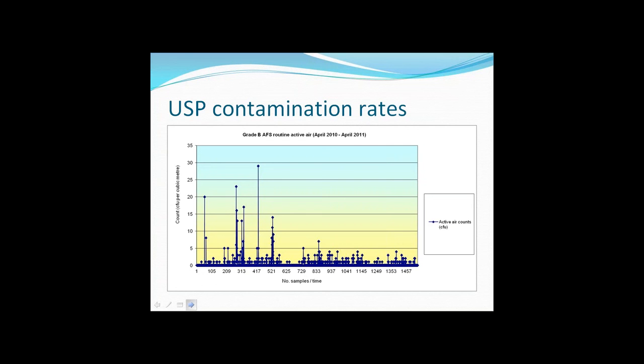So it's not a continual rolling series of non-zero events distributed over time, but an actual concentration. It's an interesting issue, and it just shows how you can take the USP approach and the EU GMP approach, present data in different ways, look at it differently, and come up with different answers and different problems.